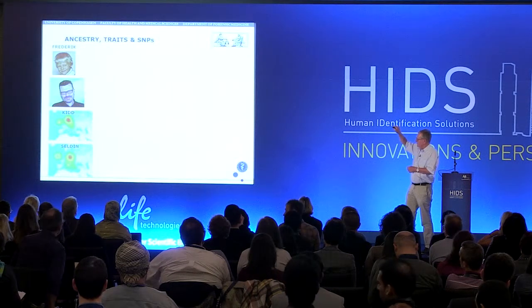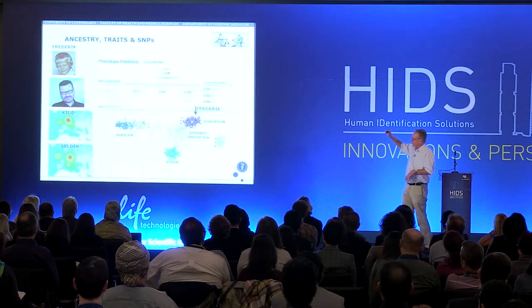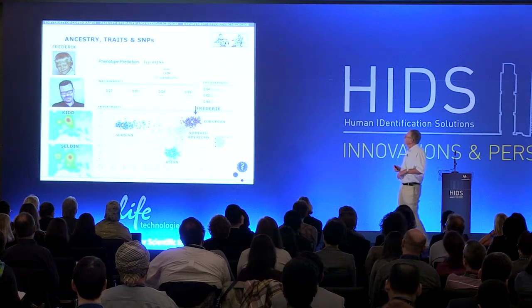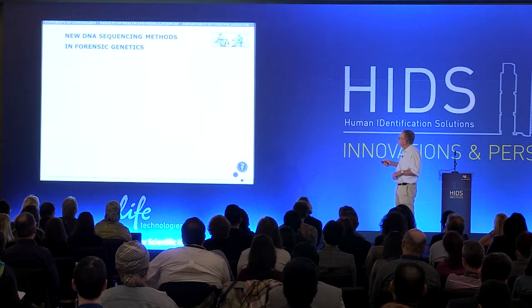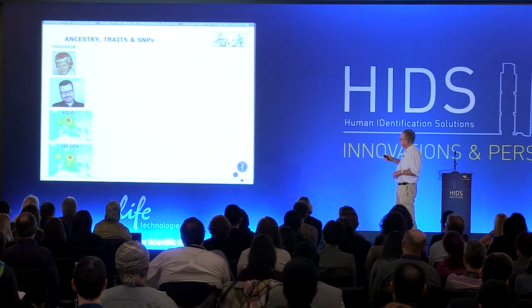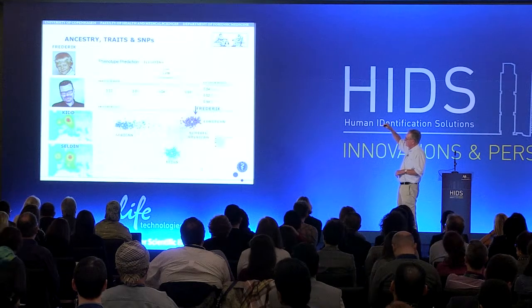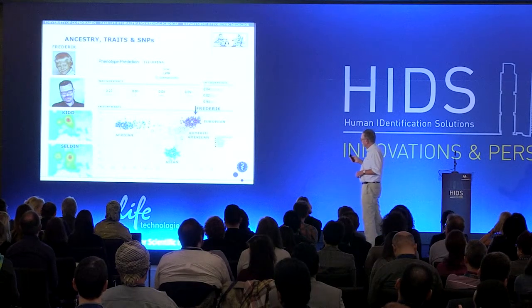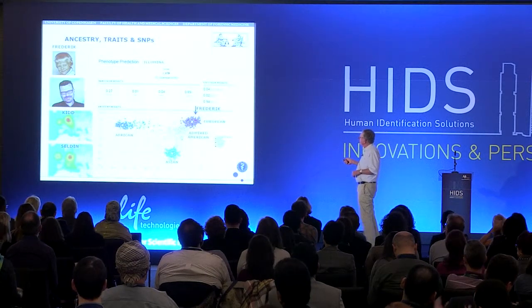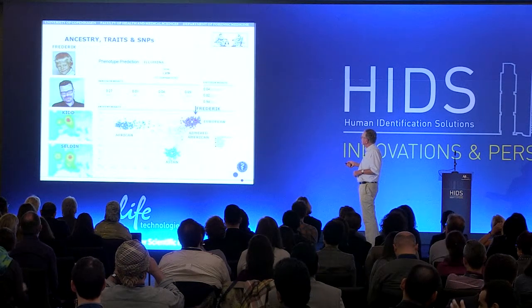So it seems as if he is predicted to be of German, Polish ancestry, and the hair color is predicted to be blond, 69%, brown, 27%.